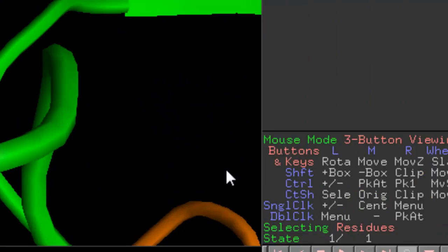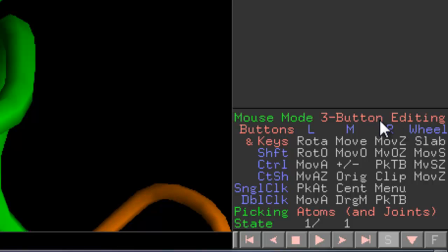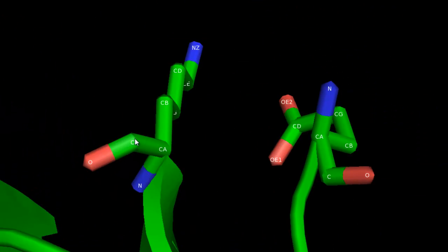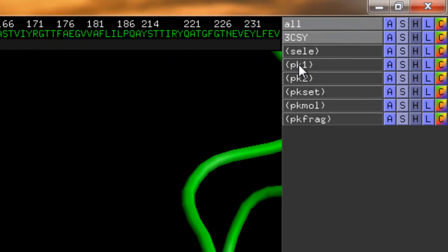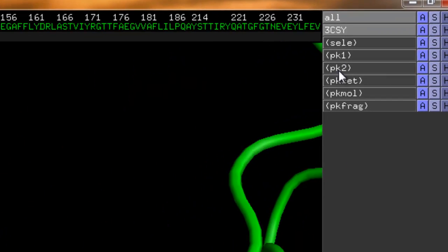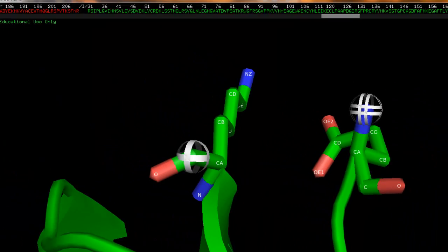We're going to the bottom. Right now the bottom says three button viewing. We're going to change the mode to editing. So once we have that, we're going to select this carbon here, and then this nitrogen here. Now we have two spheres come up, and these spheres will be called PK1 and PK2.